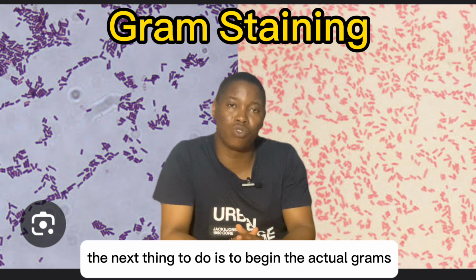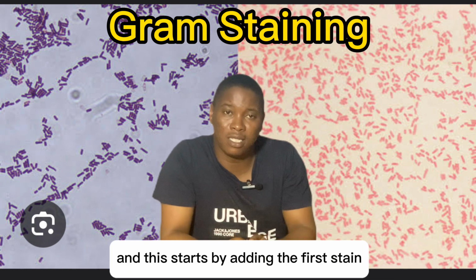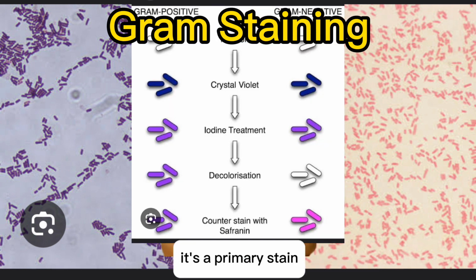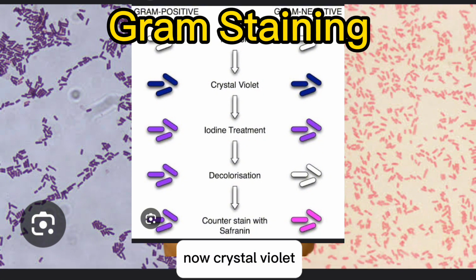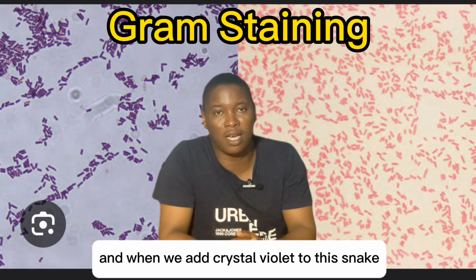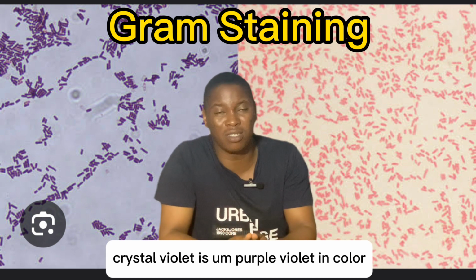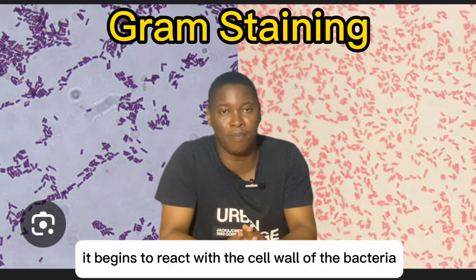The next thing is to begin the actual gram staining procedure, and this starts by adding the first stain, which is called crystal violet. We call it the primary stain. Crystal violet is added on the smear. It is purple, violet in color, and it begins to react with the cell wall of the bacteria.